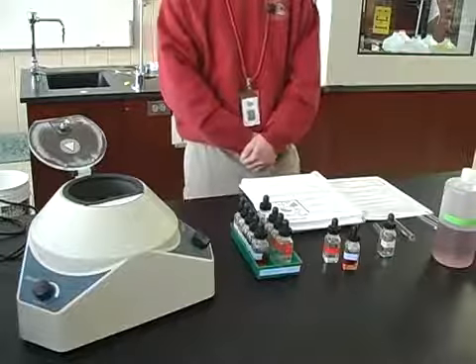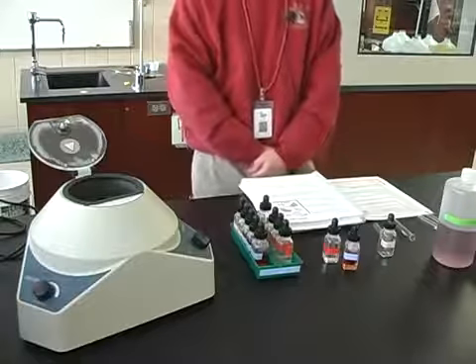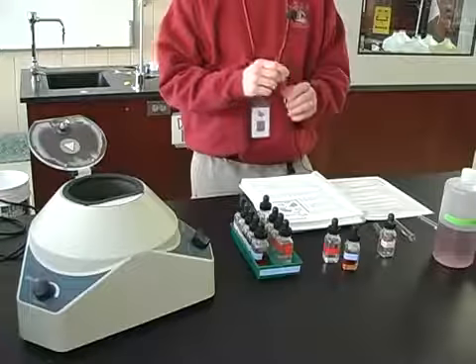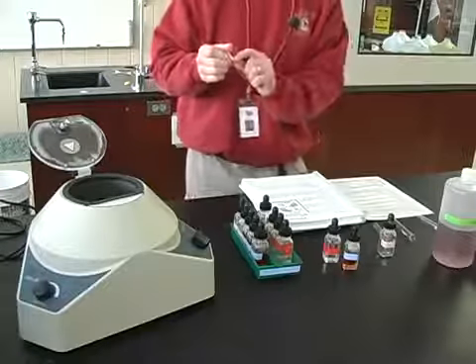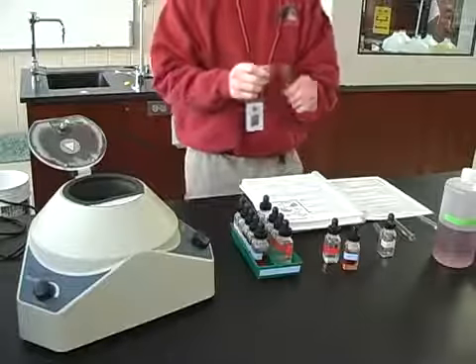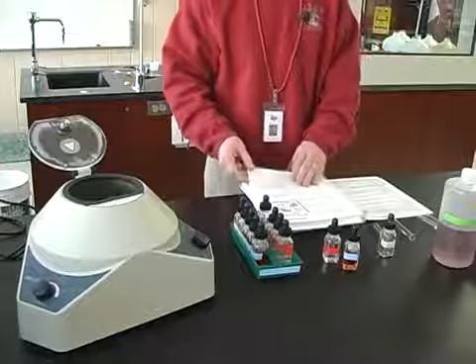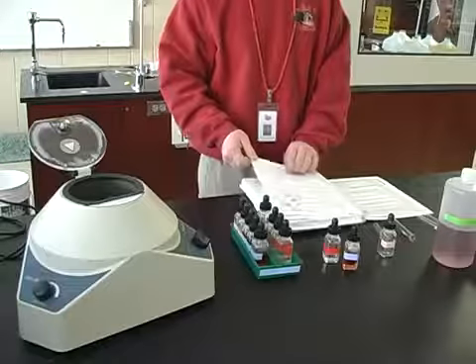Storing solutions. If you wish to keep a solution until the next lab period, make sure to stopper the test tube with a cork stopper, and then make sure to label it really, really well, because remember there's other people doing labs in here too, and then you can set that aside in your lab station. Don't trust your memory, write it down.